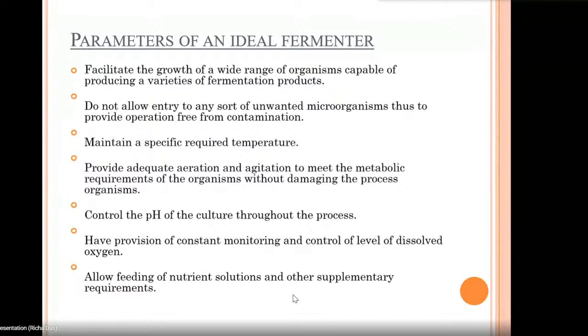Repeatedly I have to supply oxygen, so according to the oxygen levels I will be able to supply it.